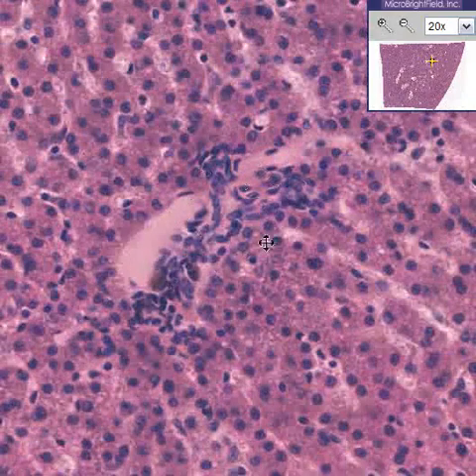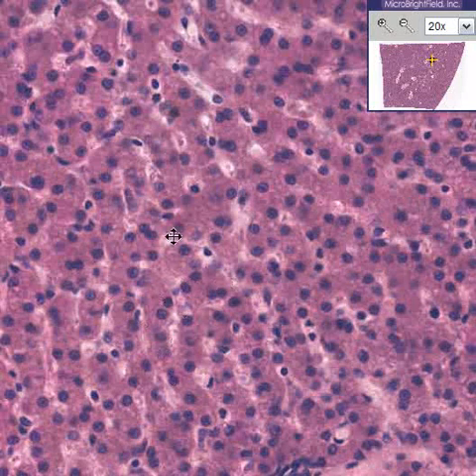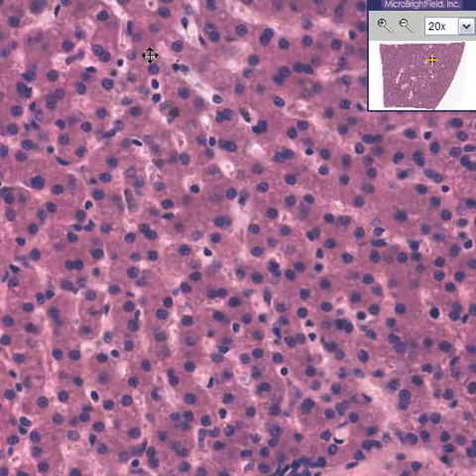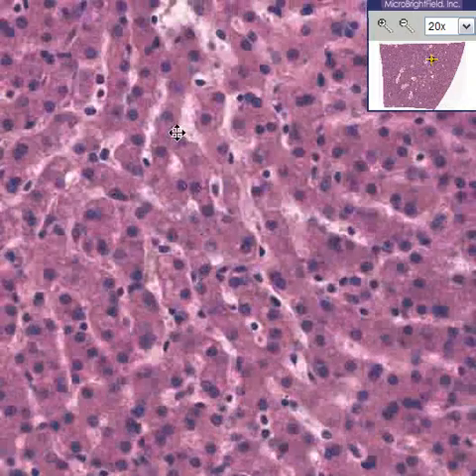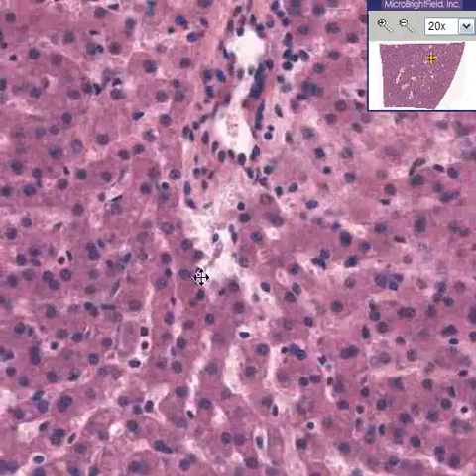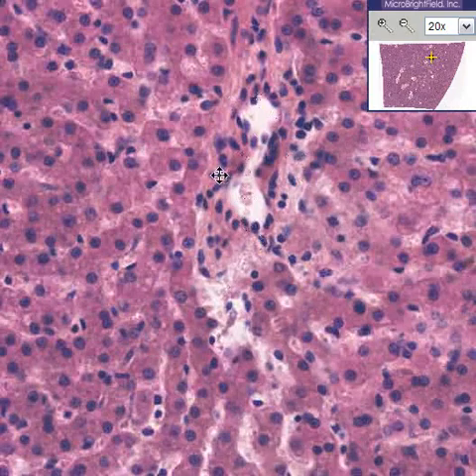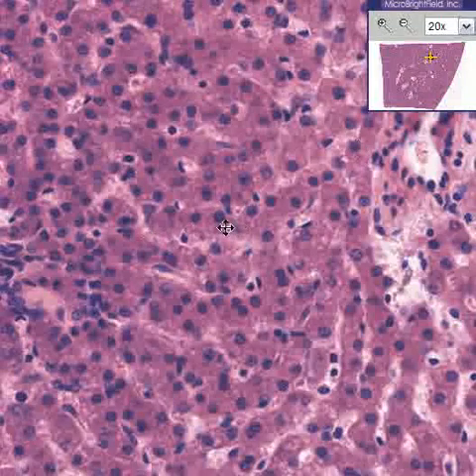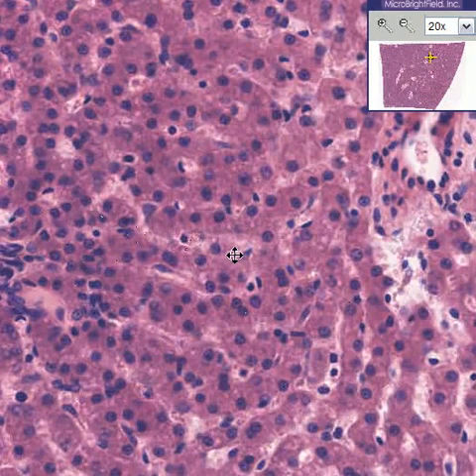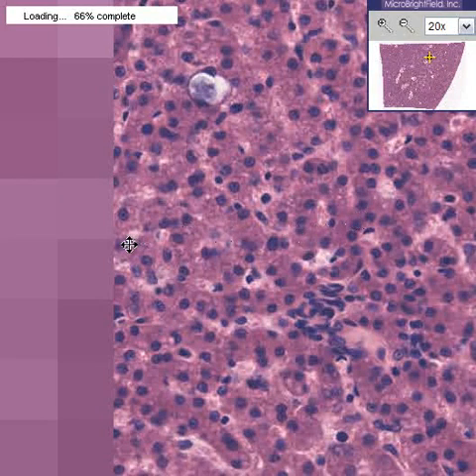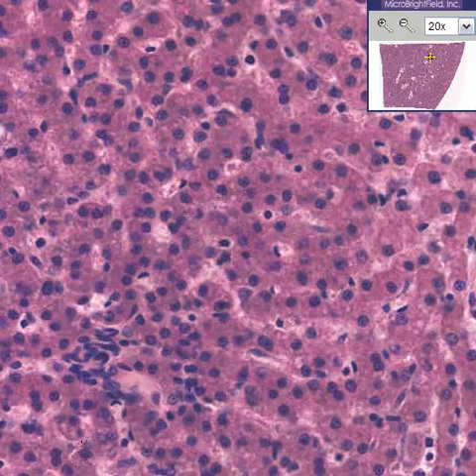Here's probably another portal triad. When you get to a central vein, you can find it by following the convergence of sinusoids. This isn't the central vein because it has some connective tissue, but it looks like the sinusoids are converging this way. And that's the end of the slide — that's the end of the show.